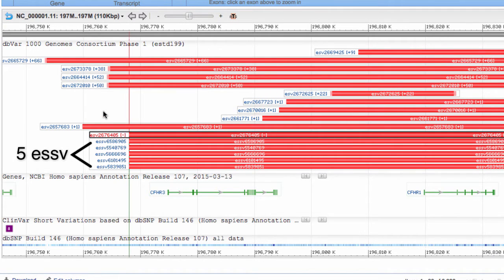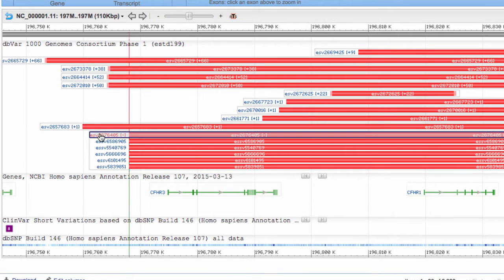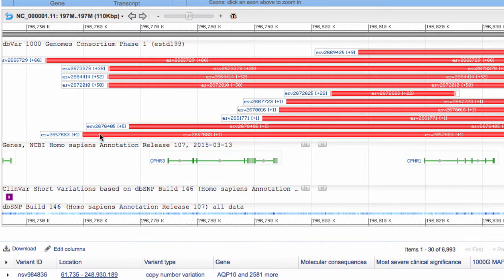Now I see the five supporting ESSVs. Another left click collapses back to the original view.